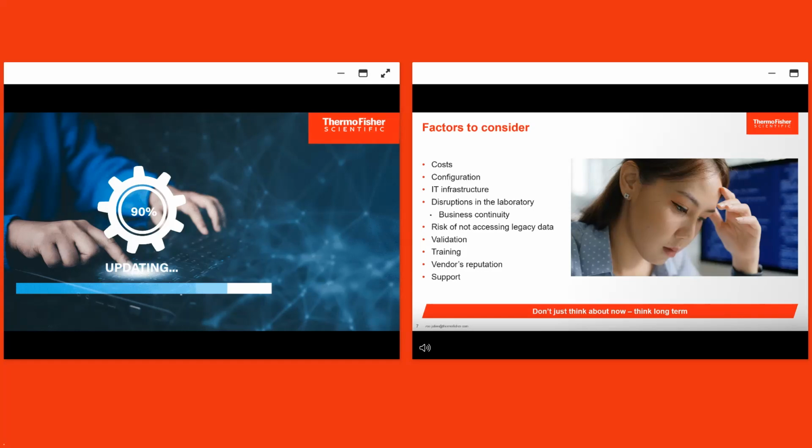Upgrades depend on the size of the CDS installation. As a guide, based on a 2 to 3 app server setup, this can usually take 3 to 4 days with the inclusion of paperwork provided and the infrastructure is in place and configured correctly. Now note, this does not include time taken for planning or any additional tasks like training, for example.